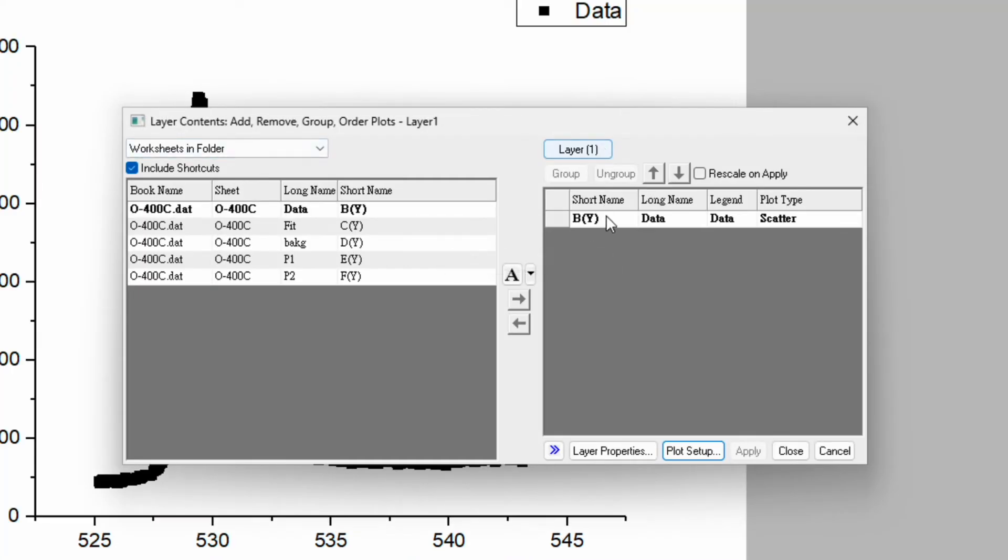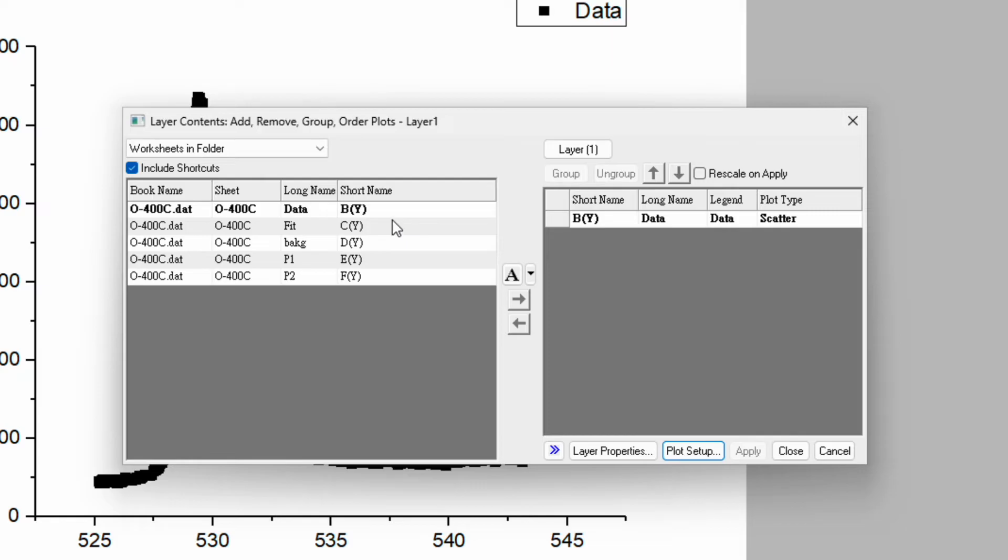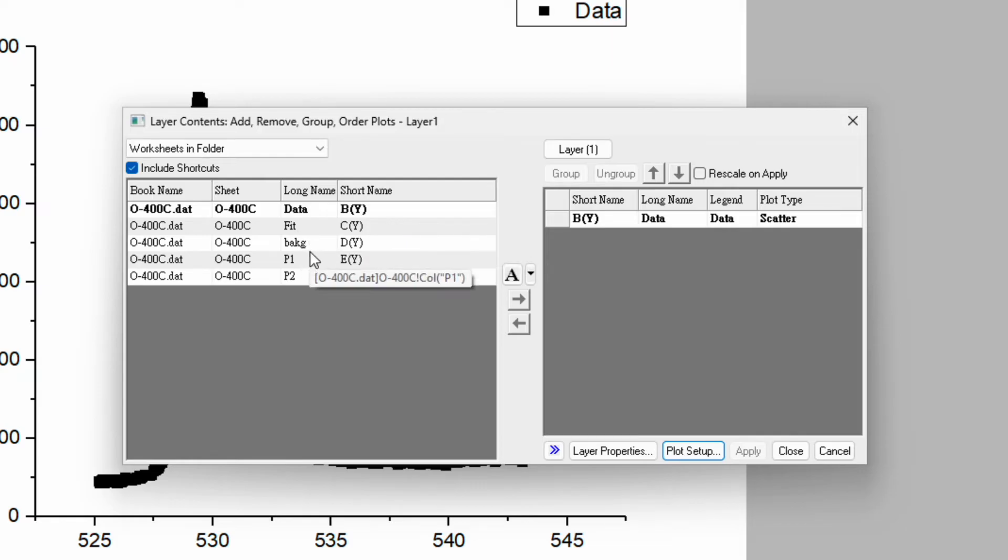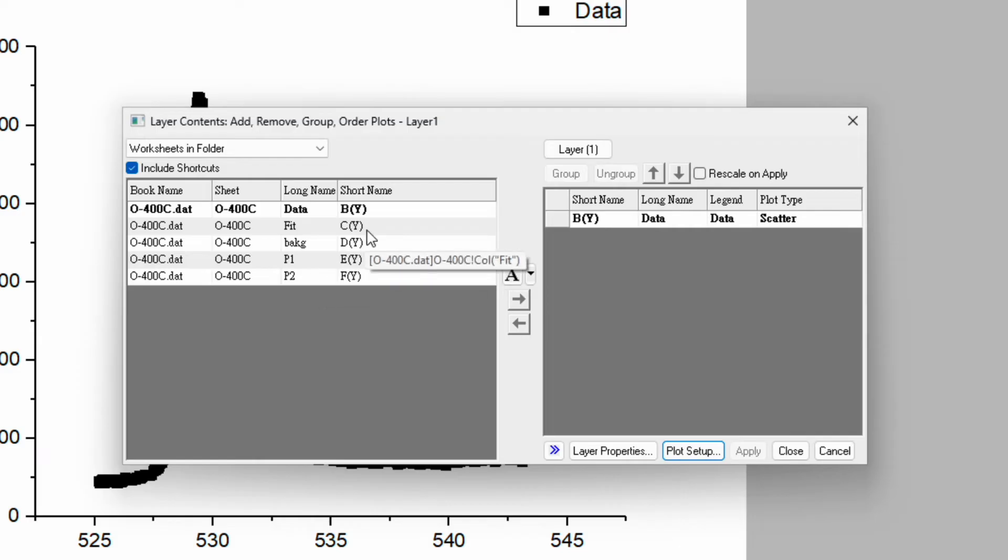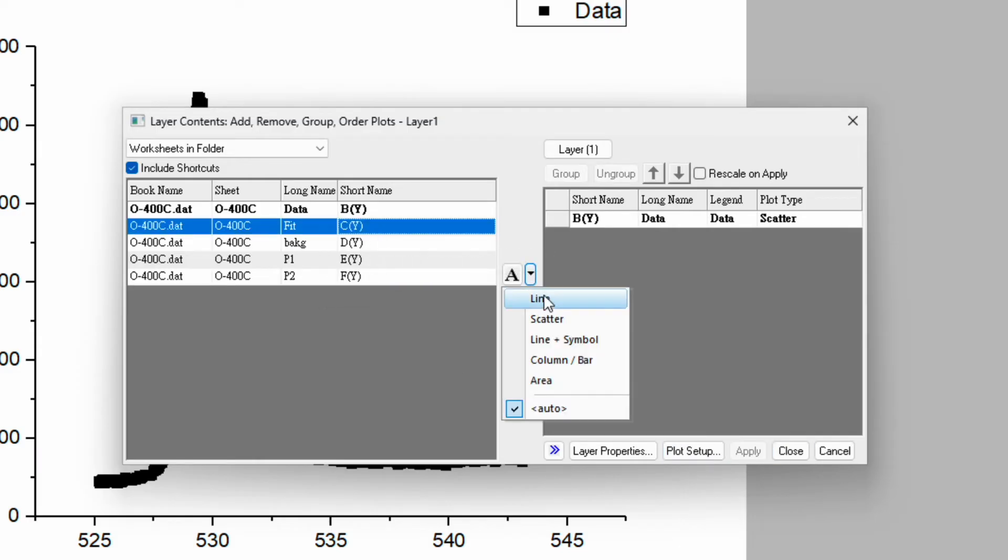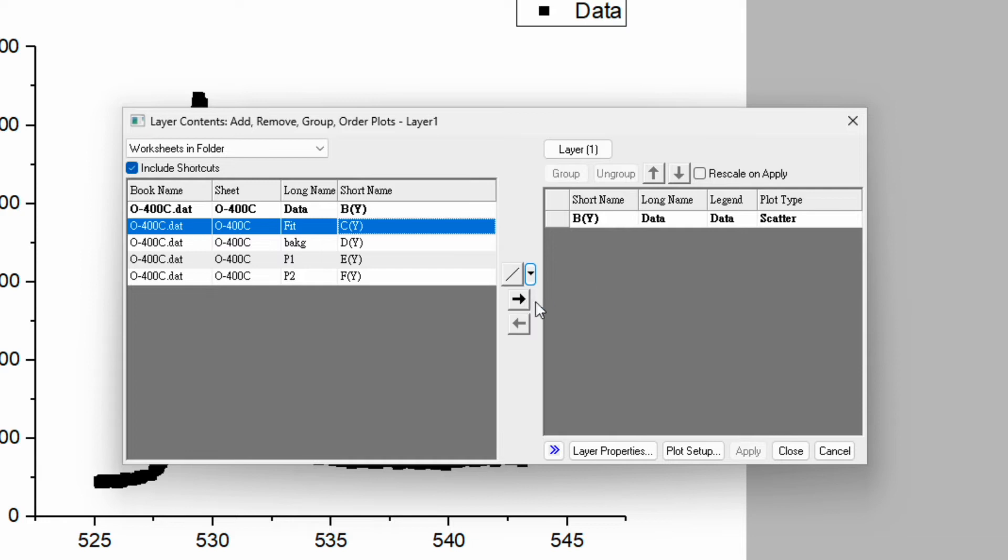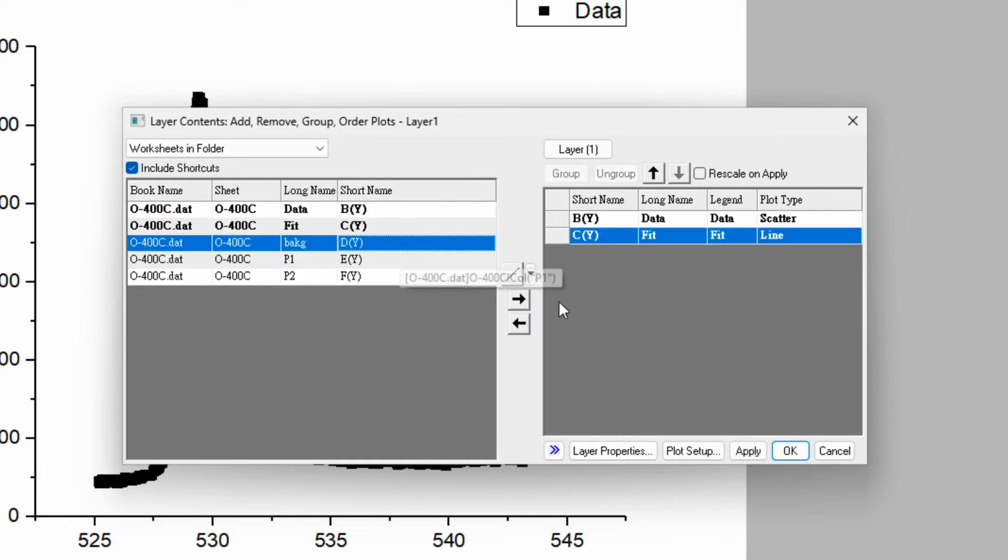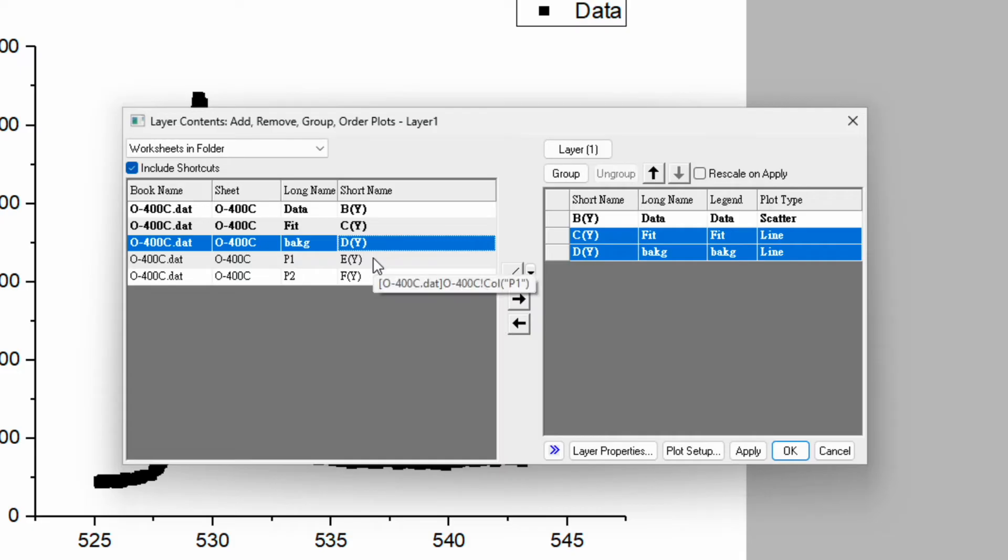Now in layer 1 right now we have only exponential data, whereas on the left hand side we can see there are few more data: fitting, background, and peak P1 and P2. Select the fitting curve, and then over here you can change option to line and click on the arrow. Do the same for the background. Click on arrow.